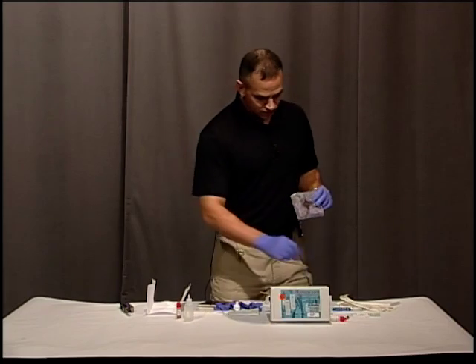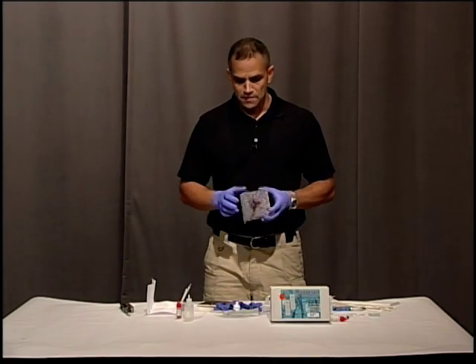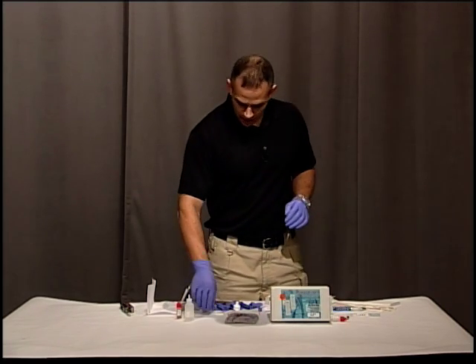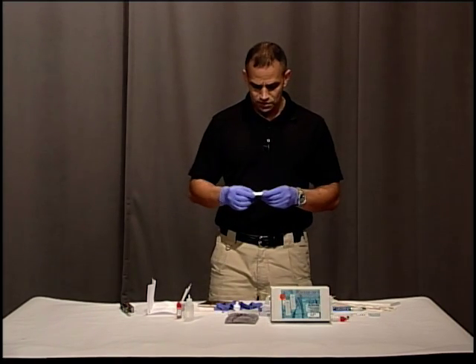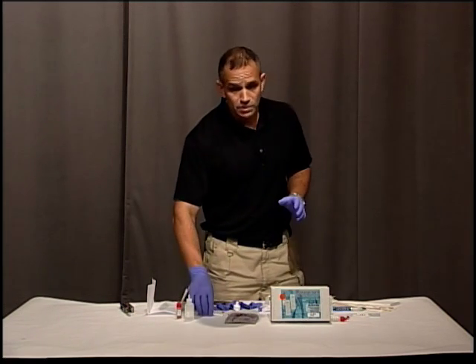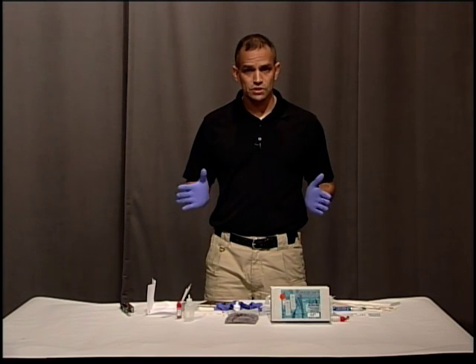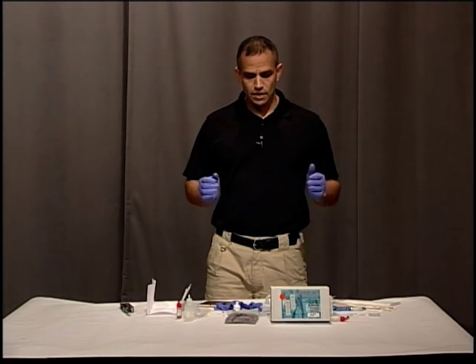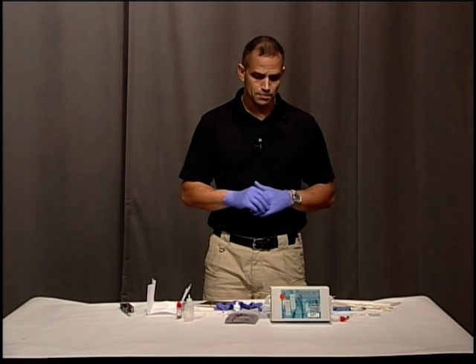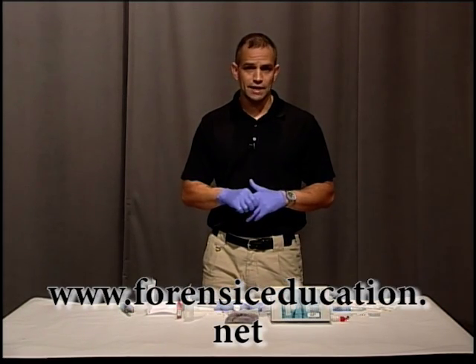Now you can swab this for DNA using your swabs and package that up properly. The most important thing is to take pictures of everything. I would take a picture of this for my evidence and make sure it gets sent in with my case so there can be no mistake that I did it properly. I hope that answers your questions on how to test for human blood. You can get all these products at lynnpv.com, and you can watch more videos on how to process forensic evidence at forensiceducation.net.